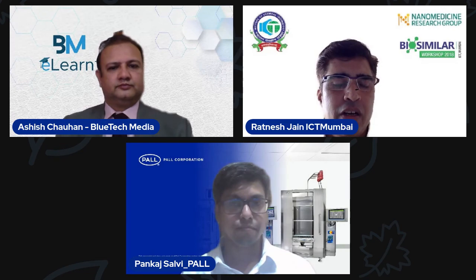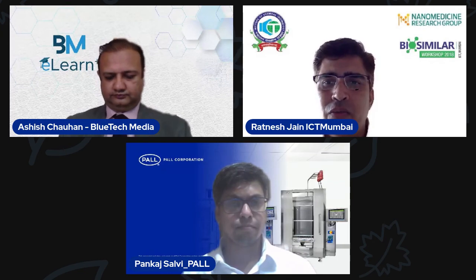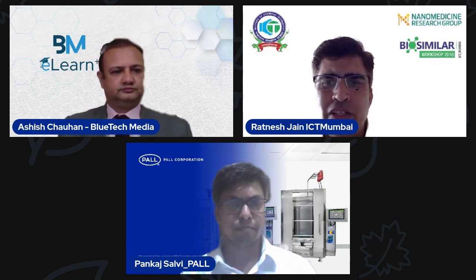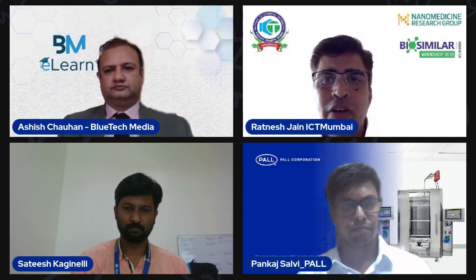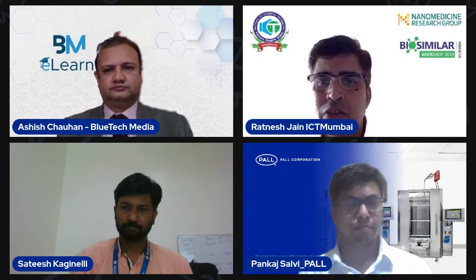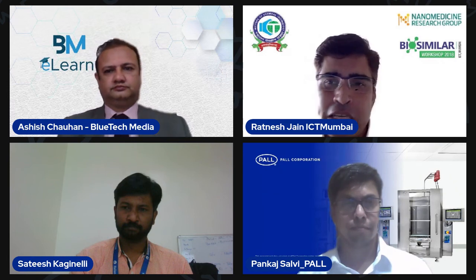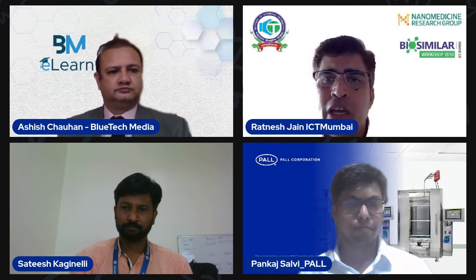Yeah. So I think Pankaj has rightly said that 4 to 6 KL scale, but 4 KL scale is something which is very well proven in terms of single-use bioreactors. It doesn't matter what kind of vendor system you are choosing, 4 KL scale is very well proven and has demonstrated success. As rightly pointed out by him, if you go to a higher scale, there are major contract research organizations, specifically out of India, like Samsung, which have tried certain other higher scales as well. But largely in Indian perspectives, 4 KL is a very well accepted scale.